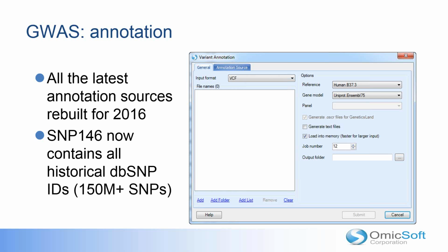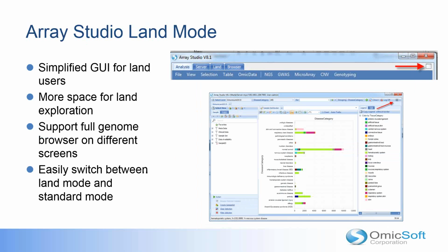So the module that works with VCF also works with the association report. And this is where the user starts to get what we call big tables, which we will fully support in 9.0. So that's the second feature I wanted to highlight at this stage for genetics analytics. Even though we have tried very hard to benchmark all these modules, a lot of these modules are based on open source tools like Minimac 3.